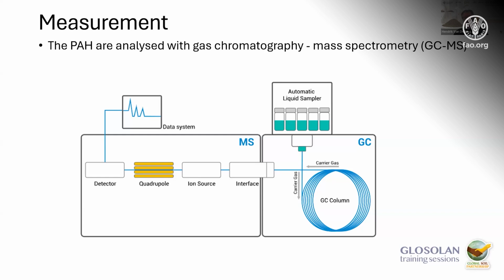Yeah, the interface here is in fact a transfer line. It's just transferring the components. There is nothing happening in this interface.